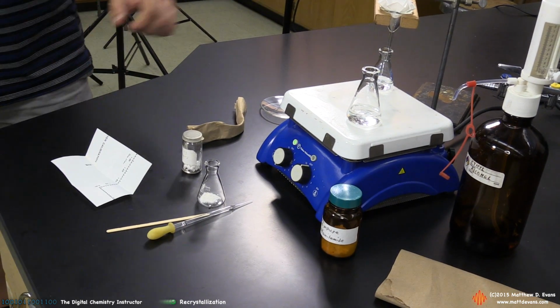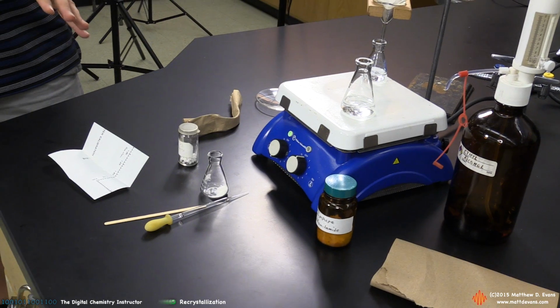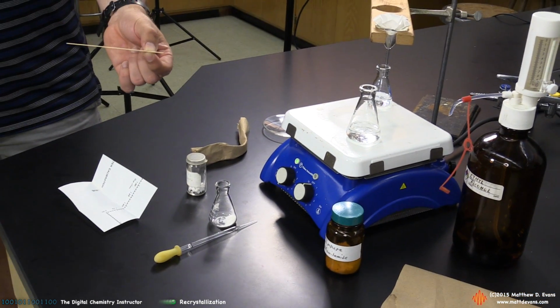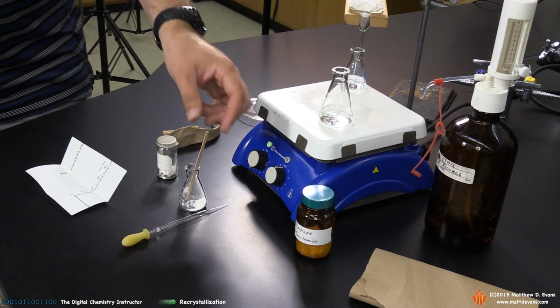Entirely into the flask. I'm not going to put this onto the hot plate yet. If I tried to do that right now, I'd end up burning my solid, so I don't want to do that. The other step is, and I've already done this video once and I forgot to do this, but here I am doing it here, is to add a boiling stick, aka a popsicle stick.